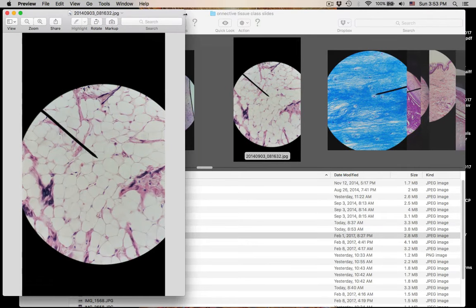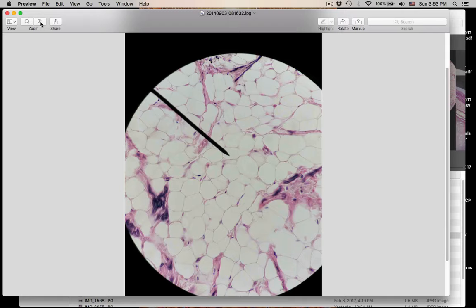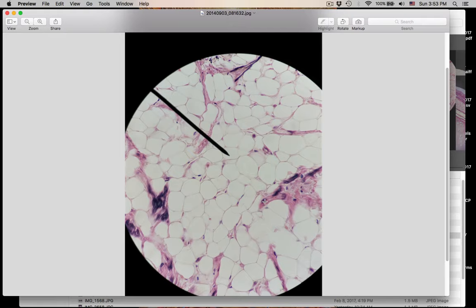This is a better one — we've seen this already. What is the name of this connective tissue? This is number nine. And the pointer is actually in what cell for number nine? What are these cells called? You see their nuclei pushed to this side. What is the name of these cells in this connective tissue? Number nine has two parts: the name of the connective tissue and the cell that's there.